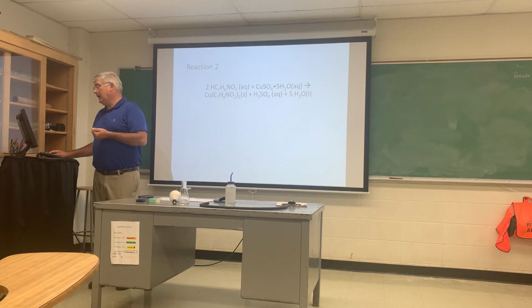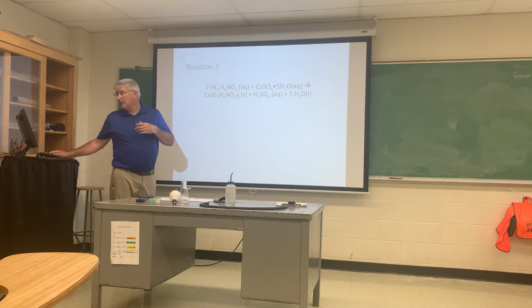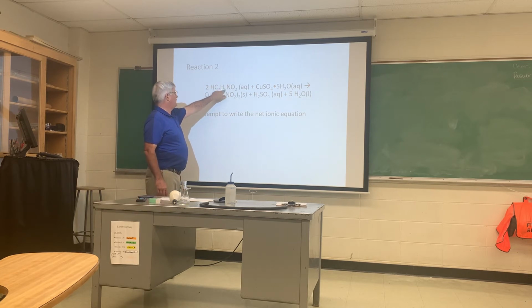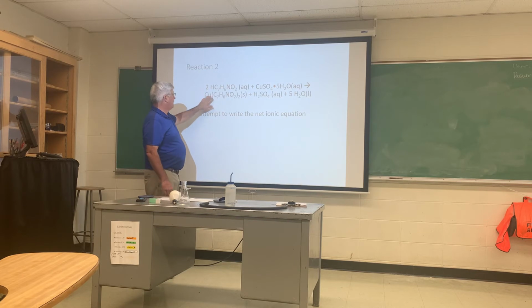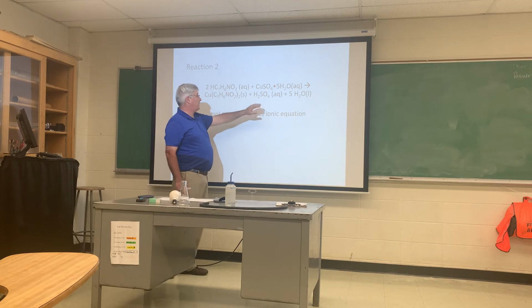All right, and the second reaction. We're actually forming a complex. What we see here is an organic molecule that has an acidic proton on it, and when that acidic proton comes off in a basic solution, it can join with the positive copper. They form a compound with a single copper and 2 of the organic structures. I'll show a figure of that on the next slide.